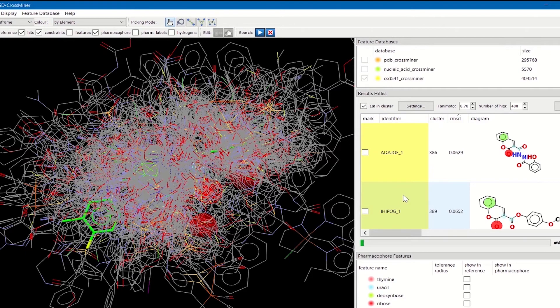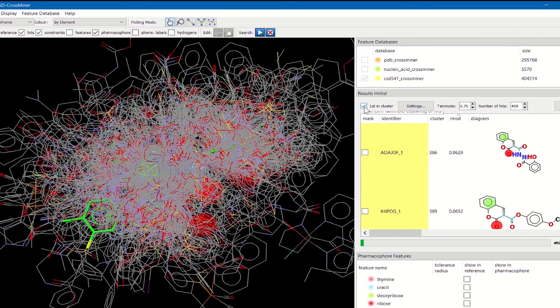The results are also clustered based on the TANIMOTO threshold represented here. By default only the cluster representative is displayed, but you can have access to all the cluster members by unticking this button.